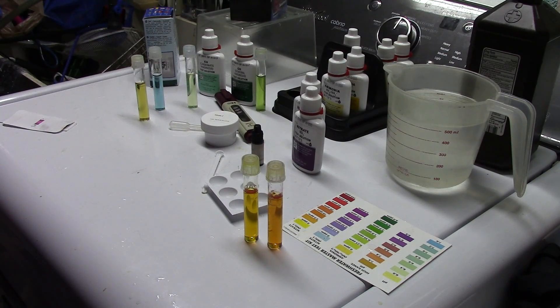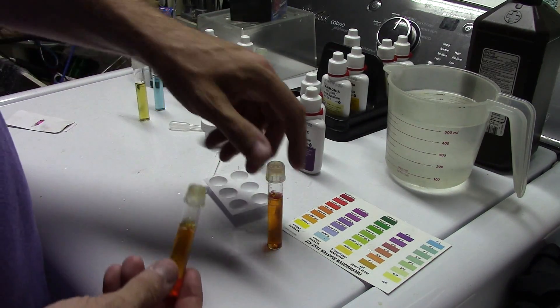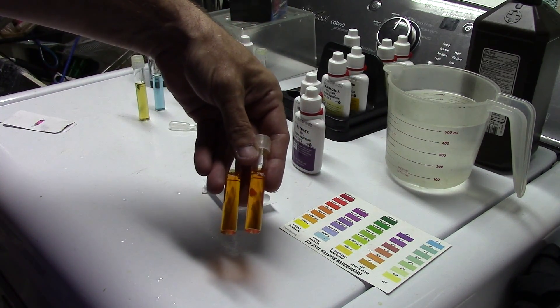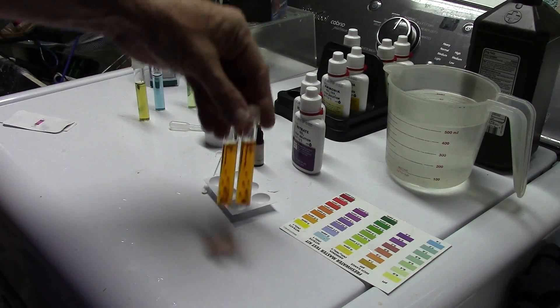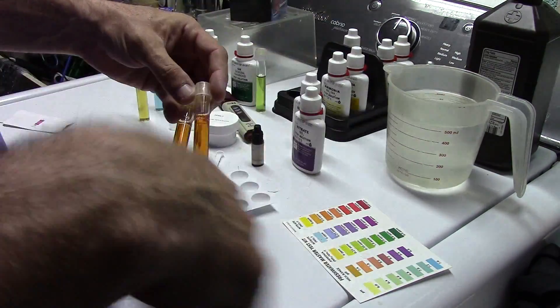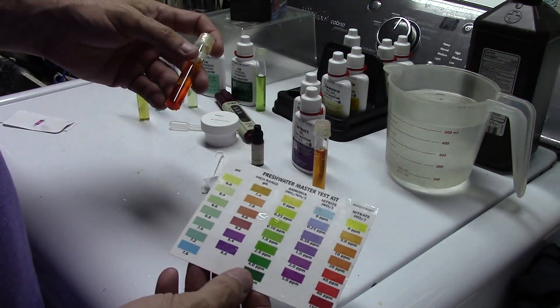Five minutes is up. To my eye I cannot tell a difference — I cannot tell which vial I shook vigorously and which one I inverted gently. So as I suspected, it doesn't really matter. As long as you keep that stuff suspended in solution for one minute after you've mixed them, you'll be fine.